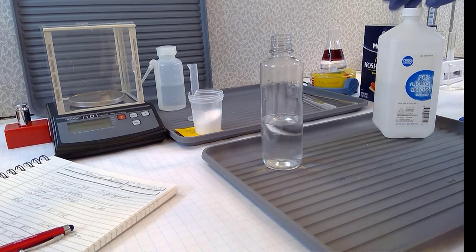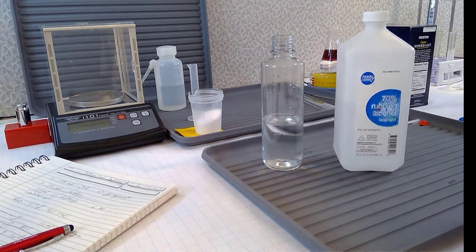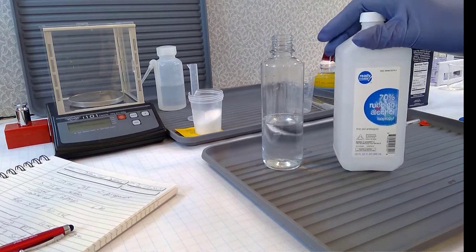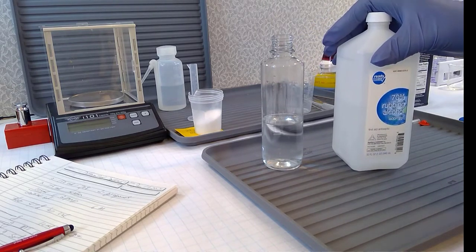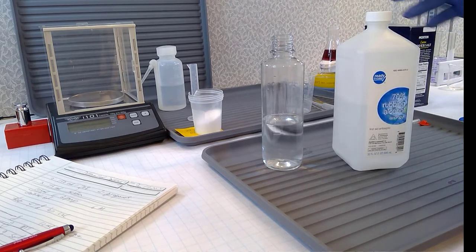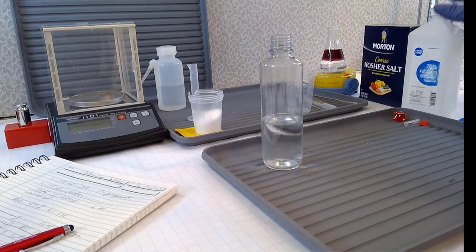You're not going to use a real chemical arrangement. And also, it's a weird percentage. It's a percentage by volume, not by mass. The density of pure isopropyl alcohol is like 0.78, so its density is less than water. So they do it by measuring volumes, which is a little bit tricky. In fact, we'll get into a complication with that later on.